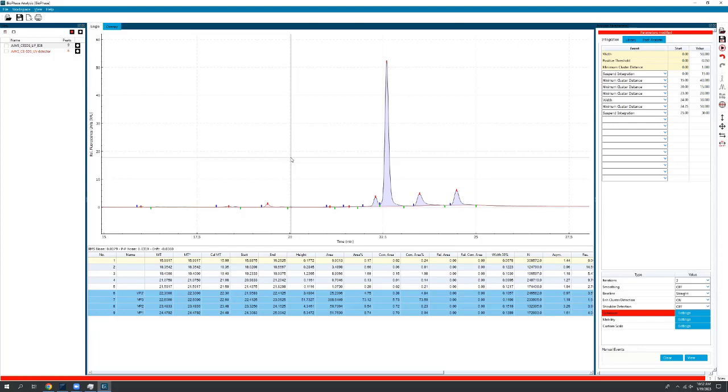And we've also alluded to how we can set that sequence up to generate a standard curve at the beginning. We can also set our sequence up to really help optimize our method. So with 8 samples being injected at once, you have the opportunity for 8 different sample prep conditions to be analyzed all at the same time.